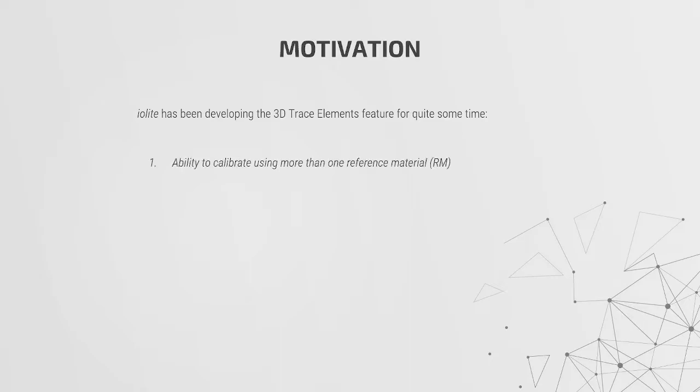So why did we create this DRS? We've been thinking about this for quite some time, a number of years. I may have spoken to some of you about it in the past, but the real reason why we wanted to do this was because we wanted to allow iolite users to be able to use more than one reference material.